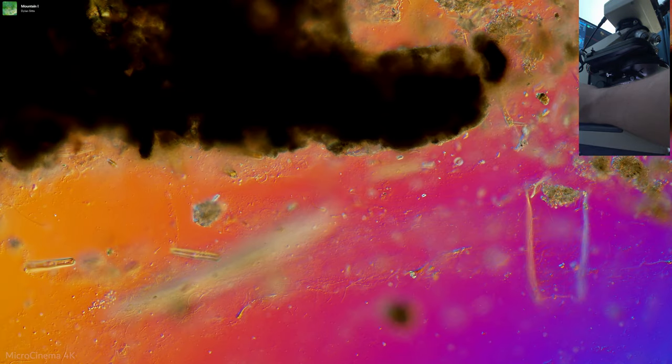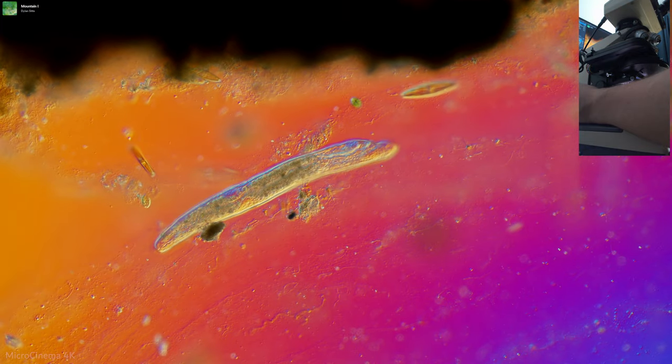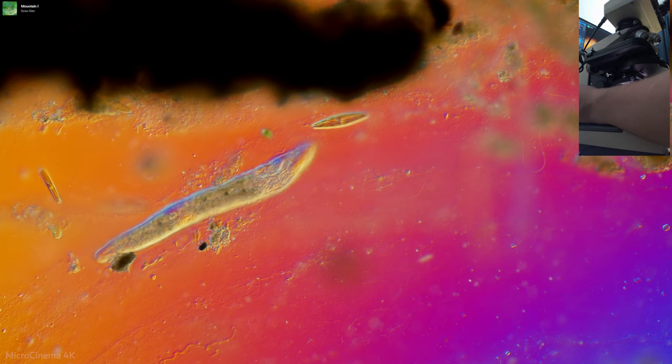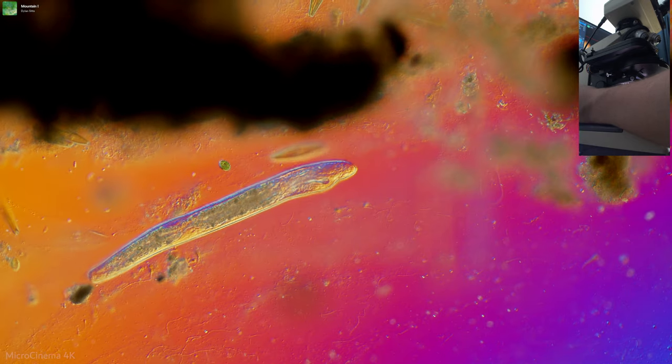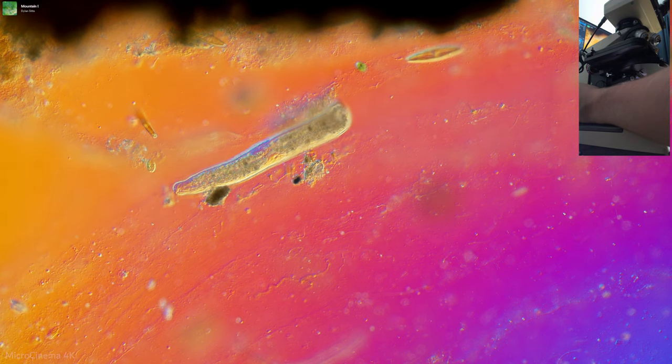But I think it's also nice to have this gradient going by. Look at that stenostomum, these things are just absolutely vicious. And so this is just a really cool effect that I do like with the 10X.